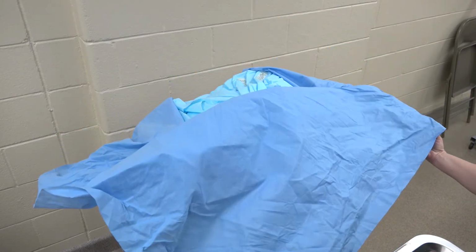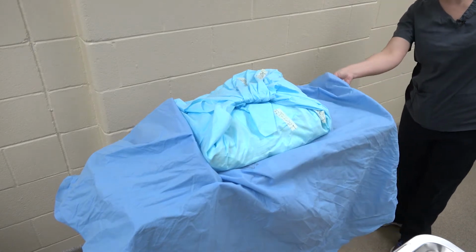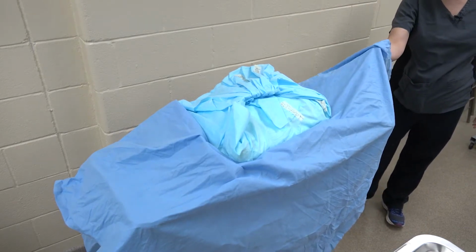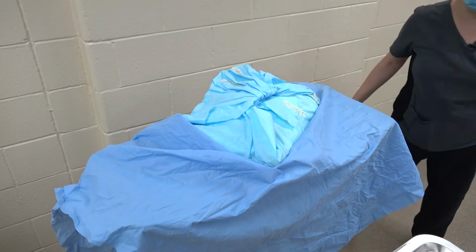All right, so now we can see that this is the inside, and what I want is my table drape here to be covering the entire table. So I'm going to shift it around using my hands on the outside of the drape. So I'm not on the inside, I'm on the outside, and I'm going to shift this around so that it covers the entire table.